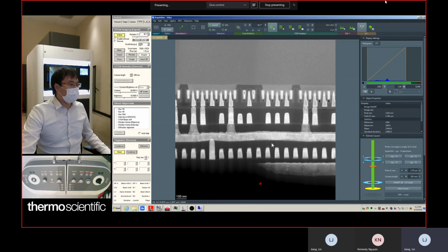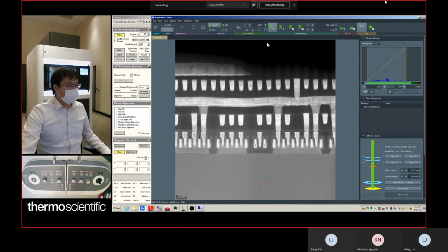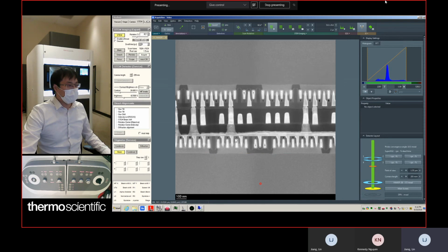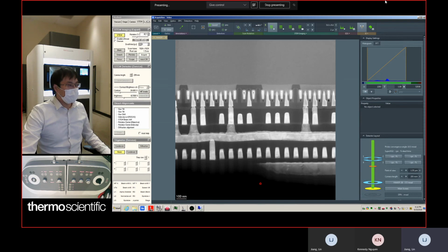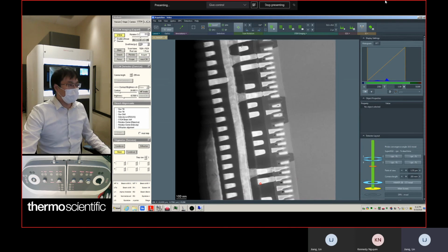And we are good to take images. So this is scan rotation. You can align across here, or you can align anywhere like this. It's your preference. You can always type the value. You can also adjust the value here. And this is a location: left 90 degree, right 90 degree, 0 degree. And this, you probably don't want a 0 degree here.